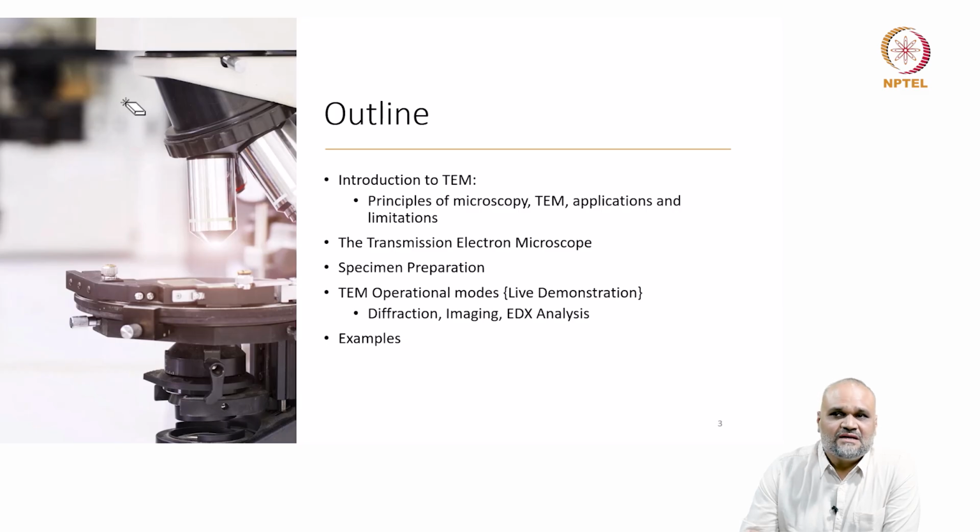So we have a few microscopes here at IIT Hyderabad. In particular, we have a lanthanum hexaboride filament TEM, we have cold field emission gun TEMs, and we have aberration corrected TEMs. But as this course is aimed at helping you start getting some useful information from a TEM, I'll start by showing you the different components of the microscope, showing you how the alignment procedures are done.